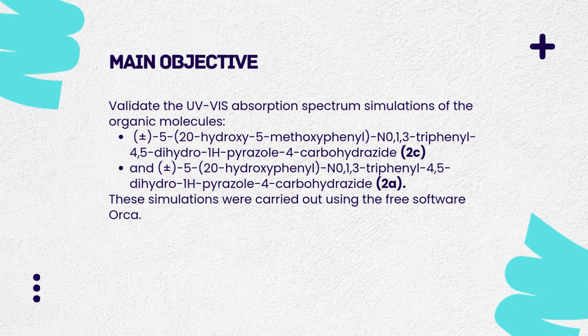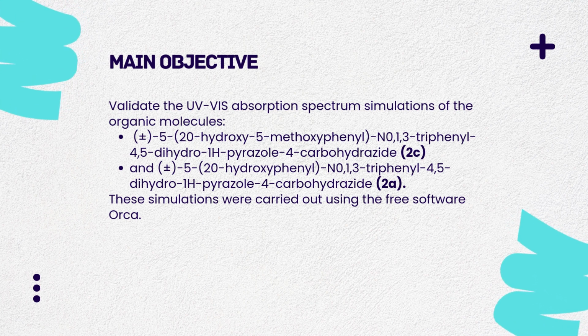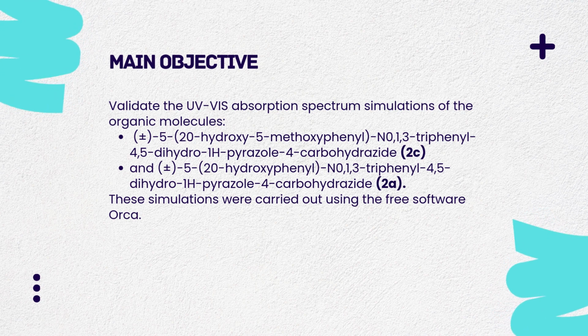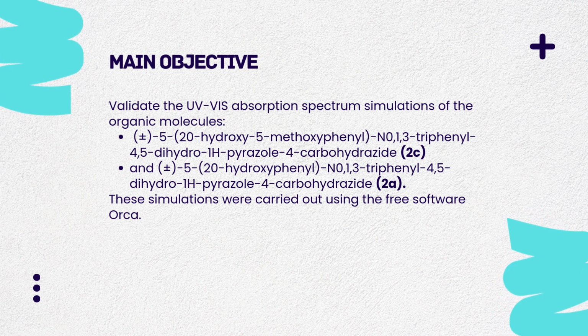The main objective of this work is to validate the simulations of the UV-Vis absorption spectra of the organic molecules 2C and 2A, which were carried out using the free software ORCA. This was done by comparing the results obtained by ORCA and analyzing the absorption spectrum obtained experimentally.